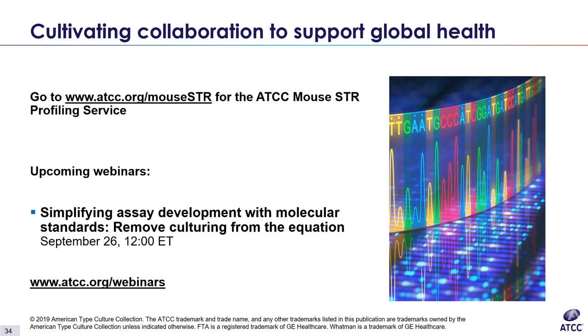I'd say that this comes down to the fact that you end up with more homozygosity with mouse cell lines. Think of it this way. Most of the mouse cell lines used in research come from inbred colonies, and there's a limited number of mouse strains. So while there will be some genetic drift, you're likely to see a lot of repetition of allele calls in many of the alleles, since they come from the same parental mice, really, if they're from the same strain. You don't see that so much with human STR profiling, because humans generally don't come from inbred populations.